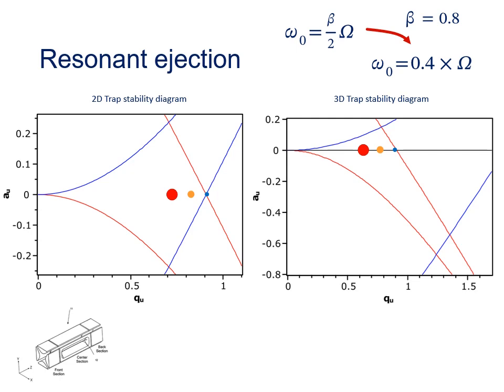And we can plot this extra signal like an iso-beta line on the stability diagrams. This extra signal is also called the tickle signal or tickle voltage, and it's used in both commercial linear ion traps and quadrupole ion traps. In linear ion traps, this tickle voltage is applied to the X rods, but not the Y rods. And in quadrupole ion traps, it's applied to the end caps.